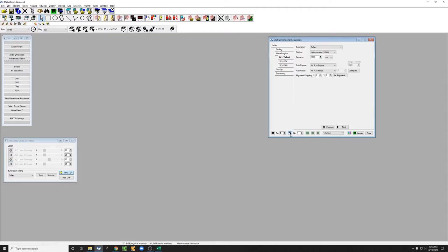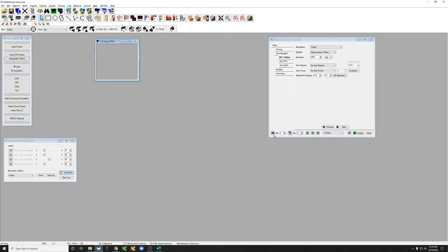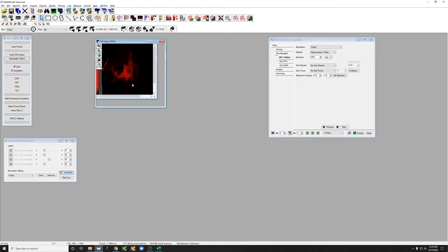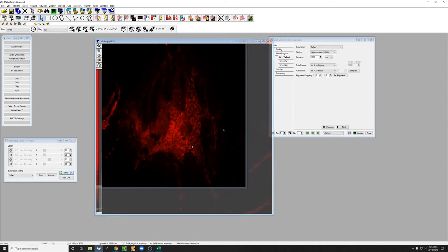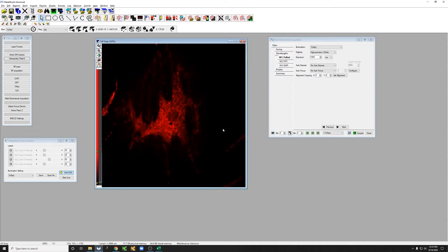I'm going to turn off the live and then increase this to 4, just to make it kind of dramatic. So if I now hit snap, what you see is that this is a much chunkier image. The signal to noise is better.